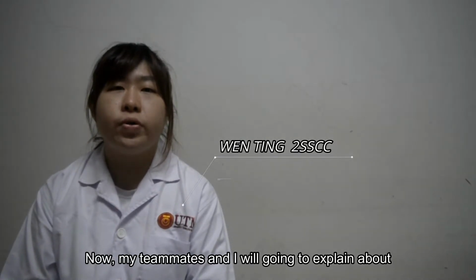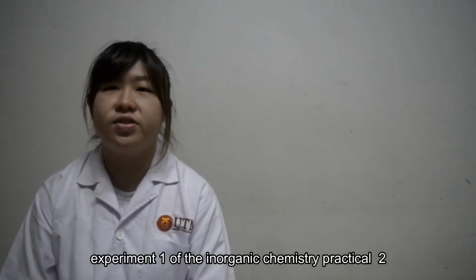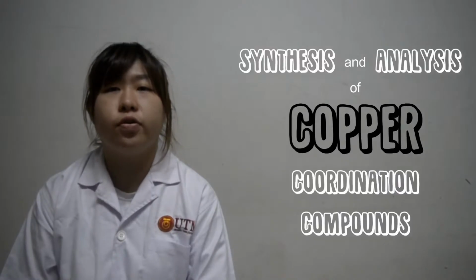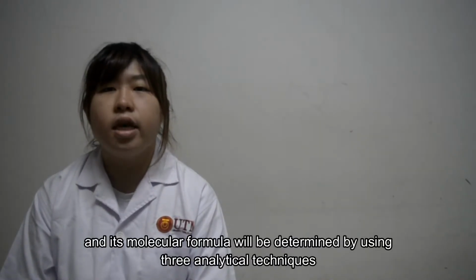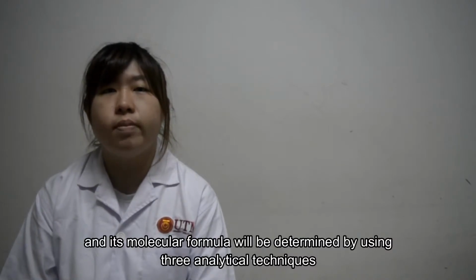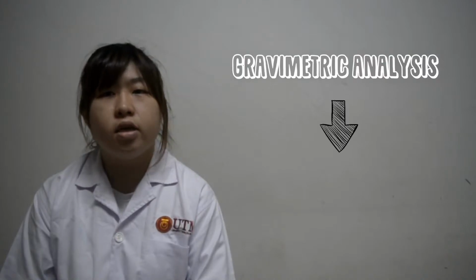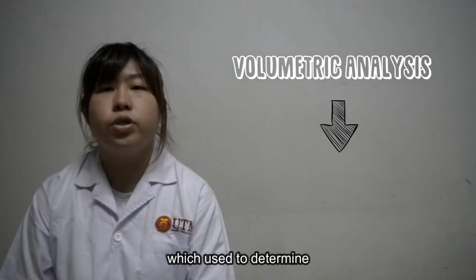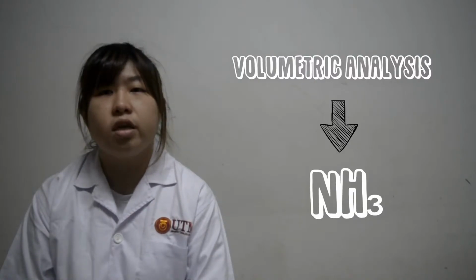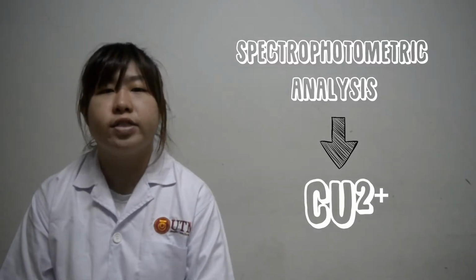Teammates and I are going to explain experiment 1 of Inorganic Chemistry Practical 2, and the title is Synthesis and Analysis of Copper Coordination Compounds. In this experiment, a copper complex will be synthesized and its molecular formula will be determined by using 3 analytical techniques. There are gravimetric analysis, which is used to determine sulfate ions, volumetric analysis, which is used to determine ammonia molecules, and spectrophotometric analysis, which is used to determine copper ions.